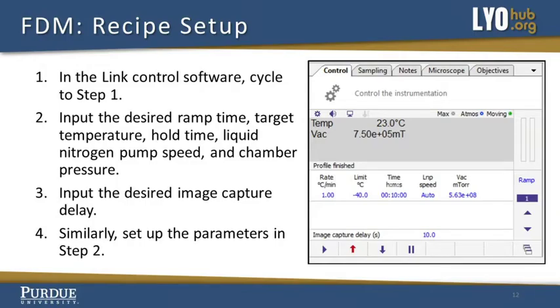Recipe setup. In the link control software, cycle to step 1 in the recipe list by clicking the arrows on the right hand side of the recipe window.